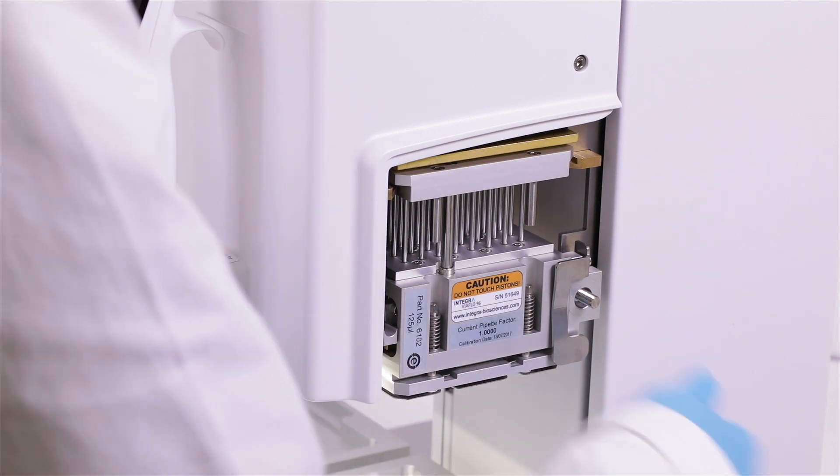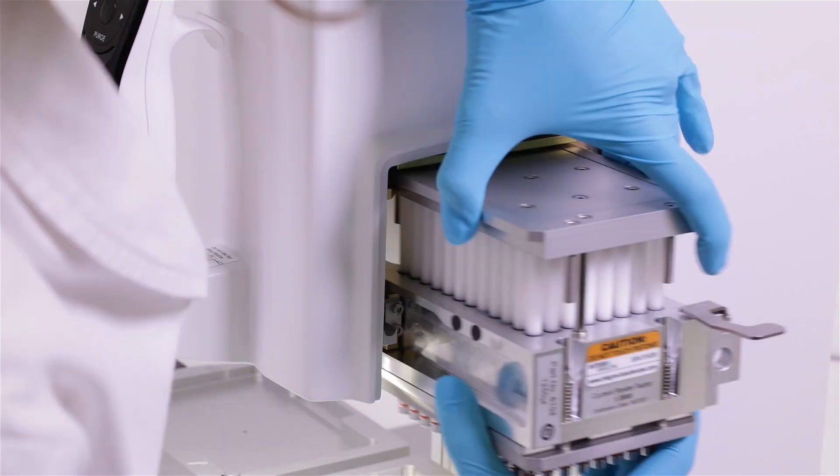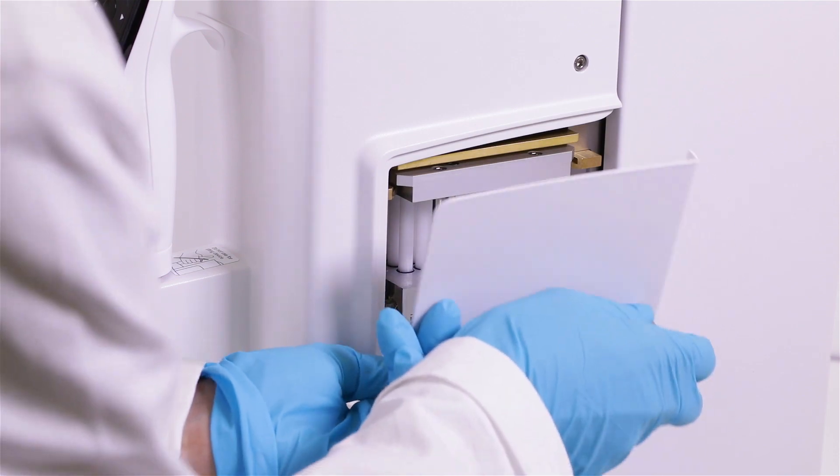Exchanging a pipetting head is fast and easy. Remove the side cover and the pipetting head, simply slide in the new pipetting head, place the cover back on, and that's it.